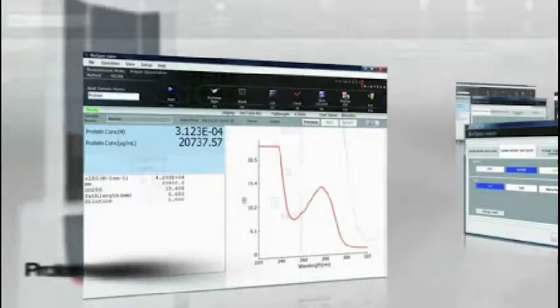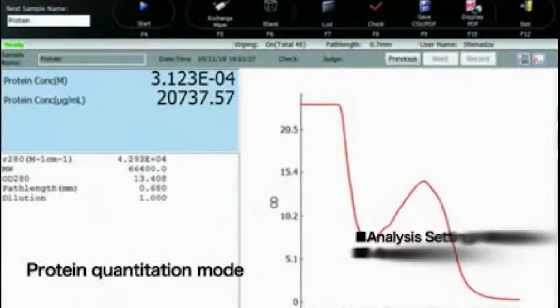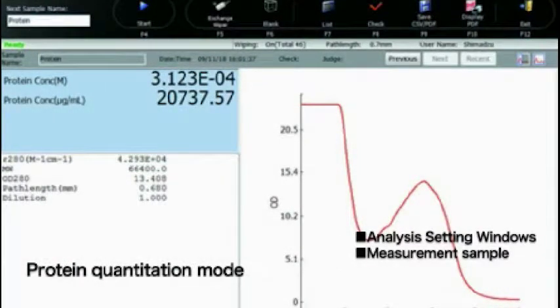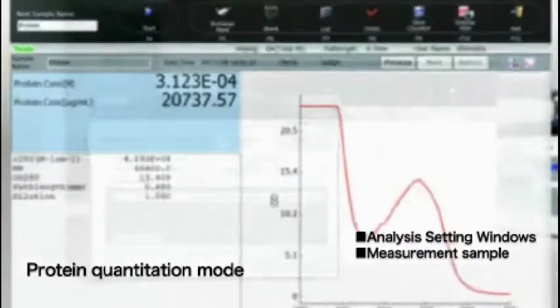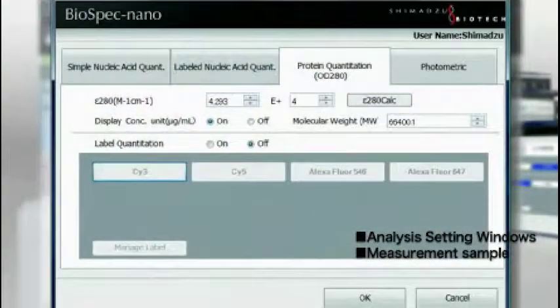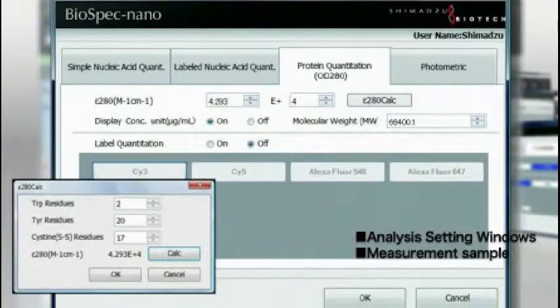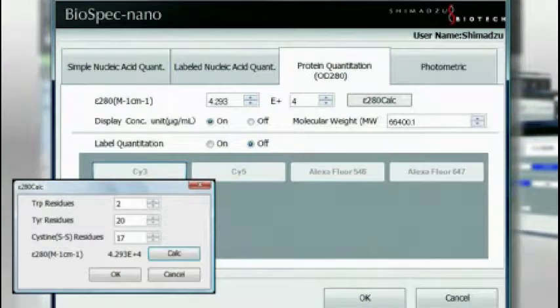And of course, the BioSpec Nano has a protein quantitation mode. Protein concentration is calculated from the peak optical density at 280 nanometers.